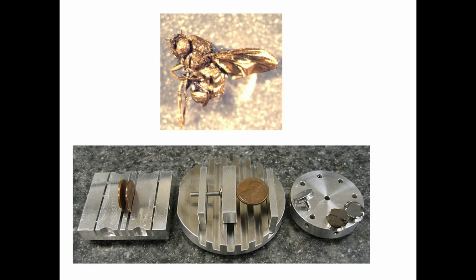But in an optical microscope it is very difficult; the surface should be perfectly flat. All the samples must be prepared and placed in the vacuum chamber. That's the only thing we have to worry about. Otherwise it's okay. But there are some disadvantages.